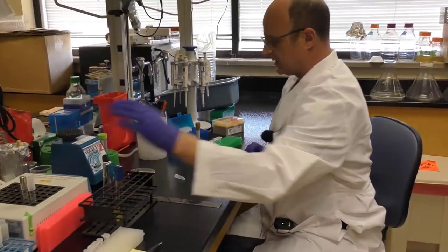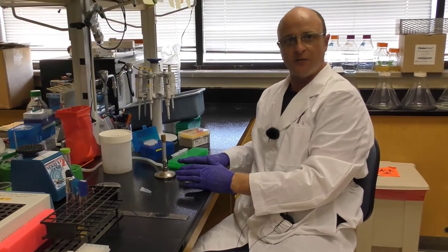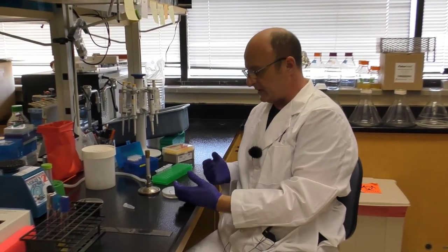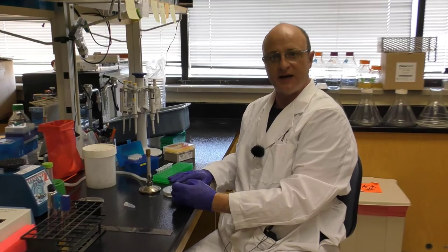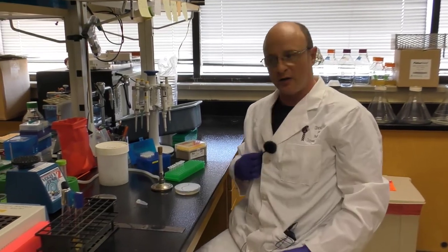And the difference here is that this is now done. It doesn't have to set with the lid cracked because I'm not going to put any liquid on top of it. As soon as that lawn is set, we can invert the plate and incubate it.